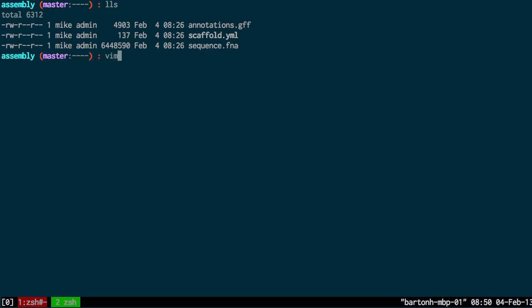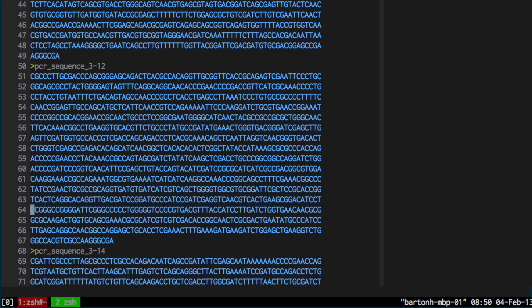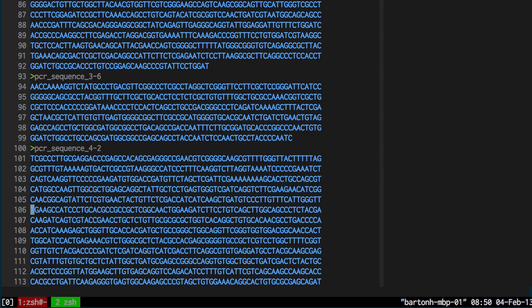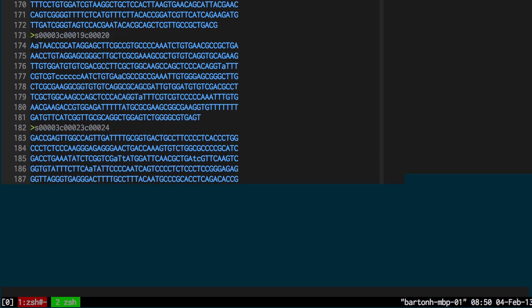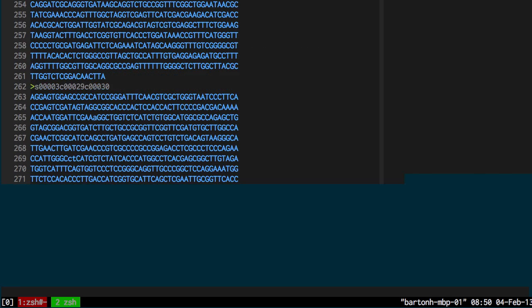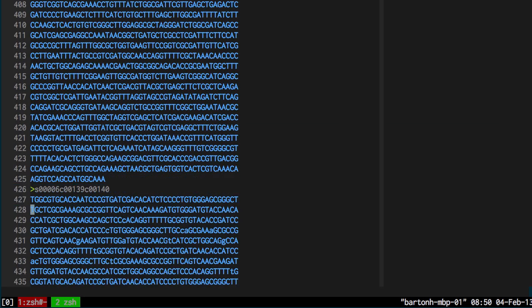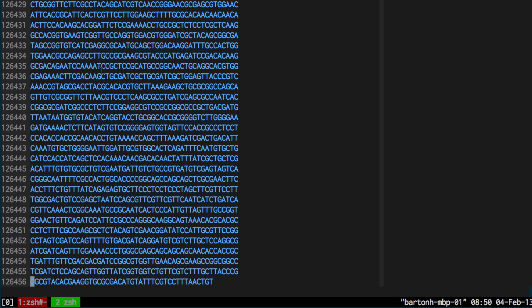First, the sequence file contains all of the contigs and sequences I've generated using sequencing and PCR. You can see there's a lot of sequences here and by the line numbering there's around 126,000 lines of FASTA.